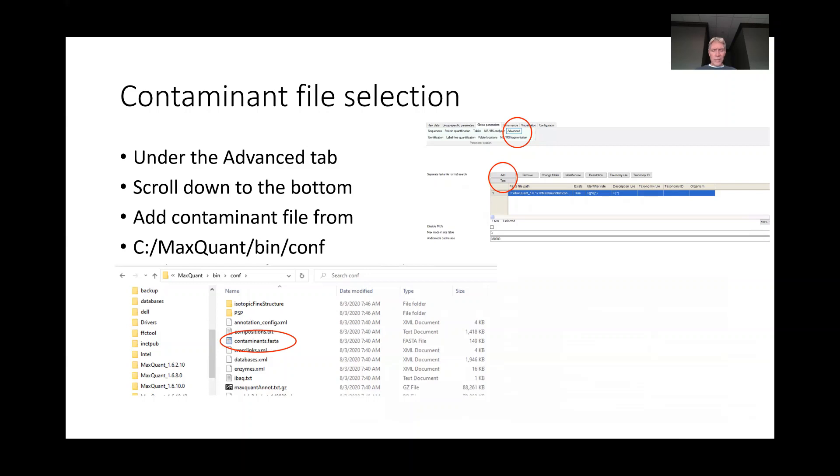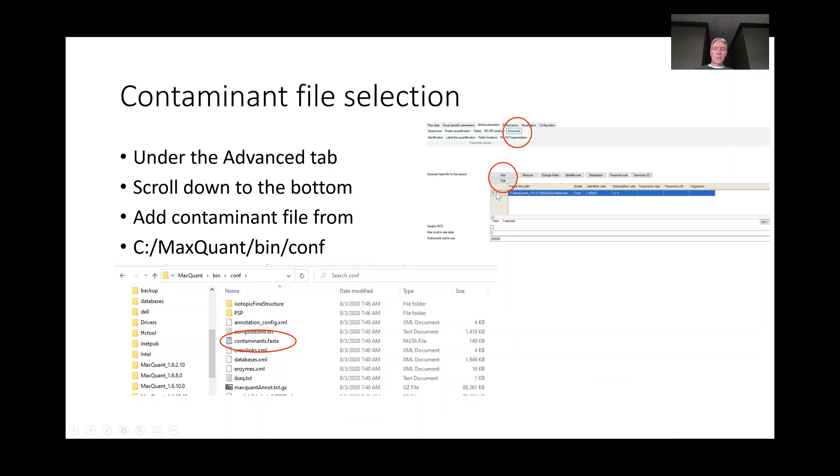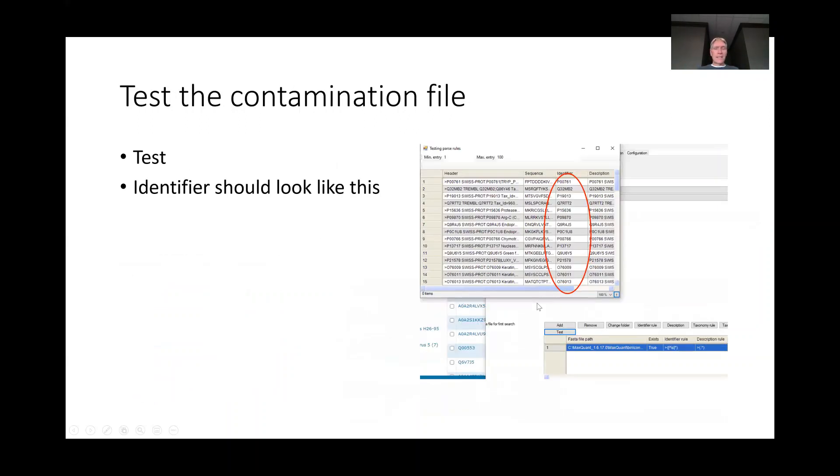You also need to go under the advanced tab here, and you need to add a separate FASTA file for your contaminations. You can get your contamination file, which includes skin and other things that are found in the lab that work their way into your samples, and so then you can test that as well, and it should look something like that.